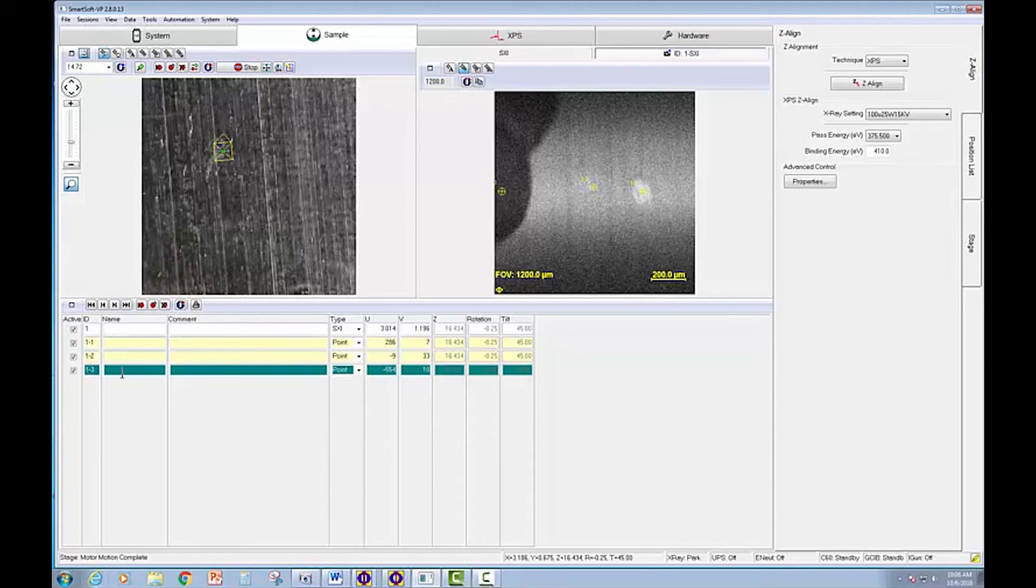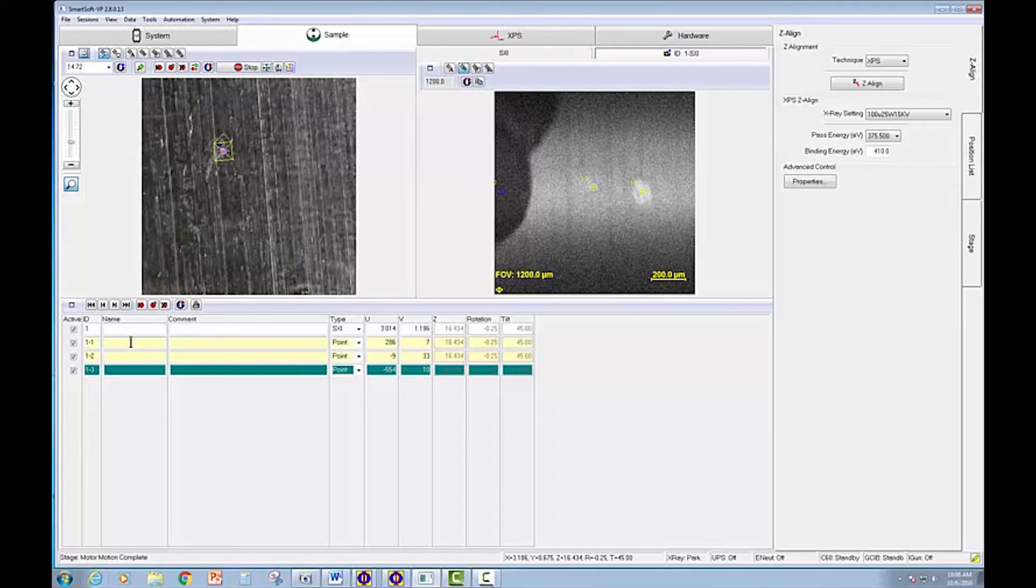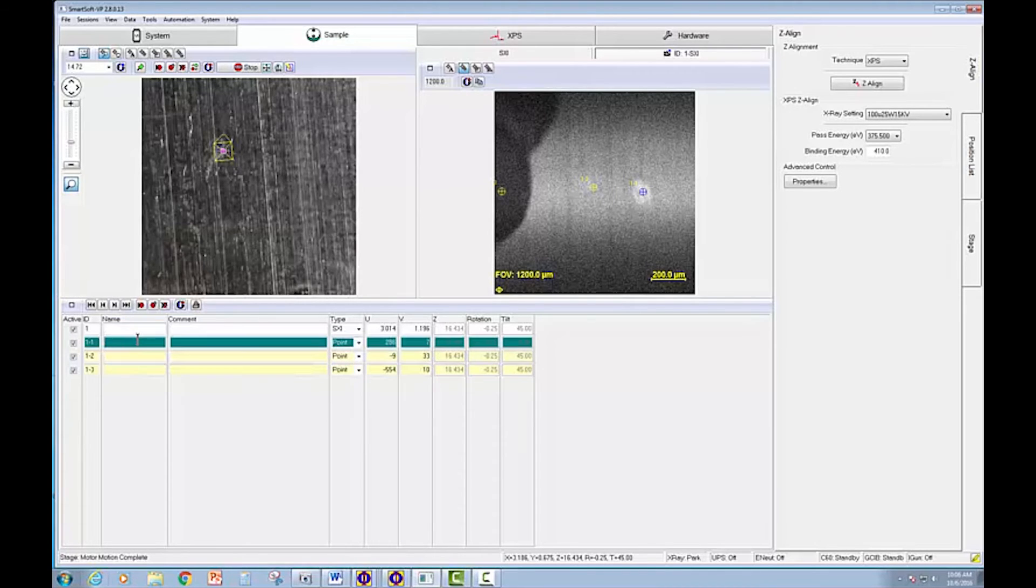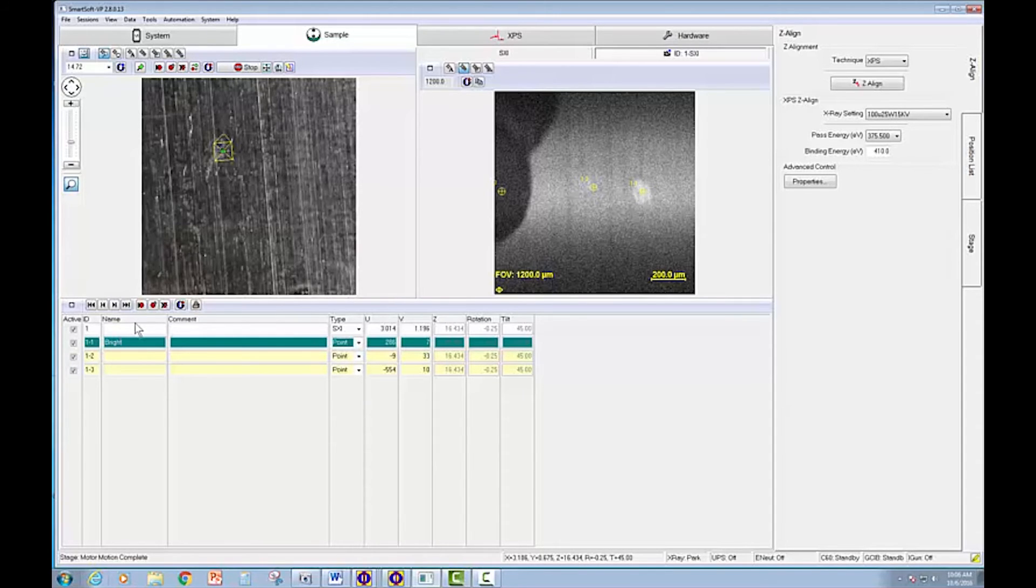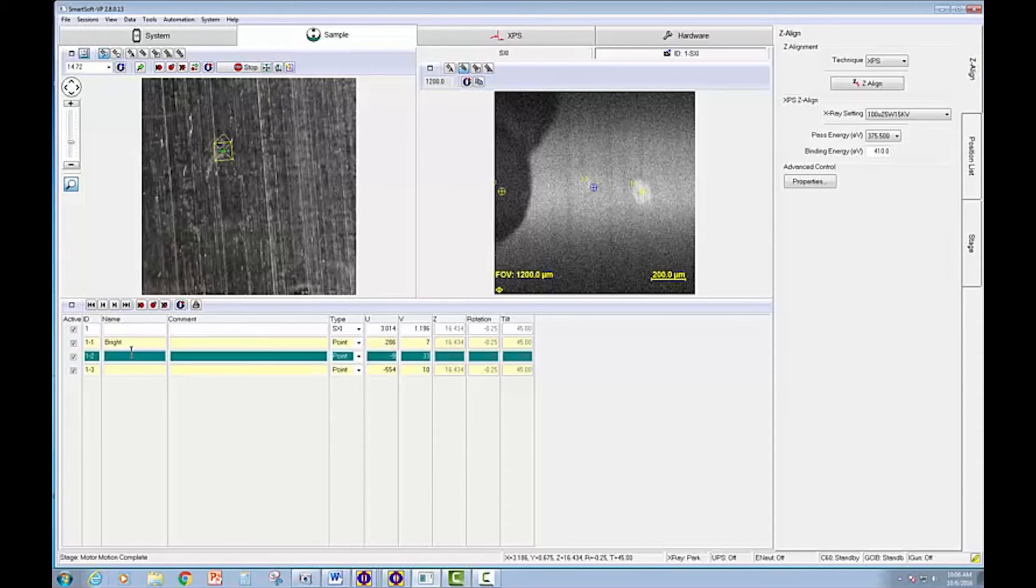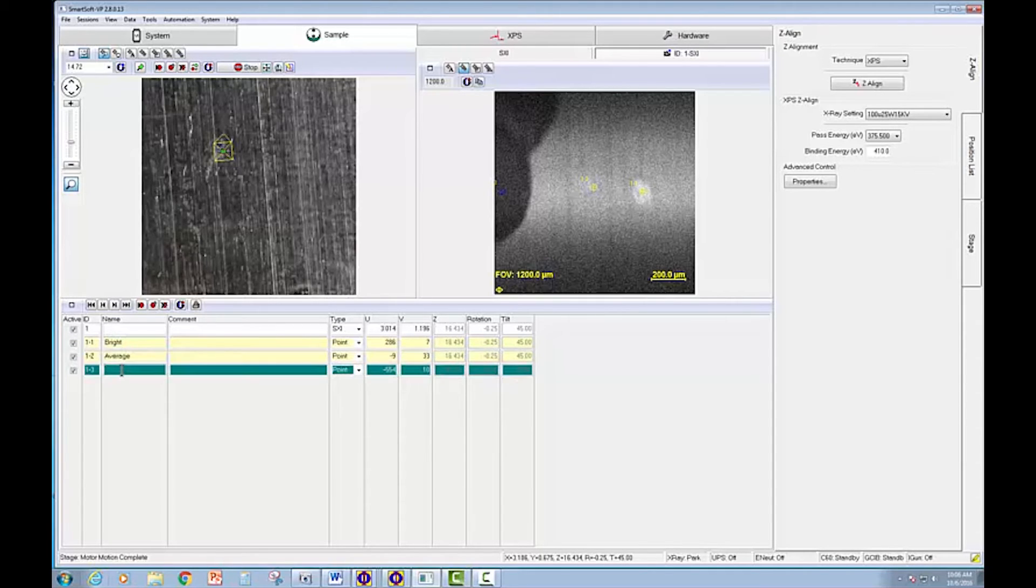So you can see we have three points defined. And I'm going to just label them as bright, average, and dark.